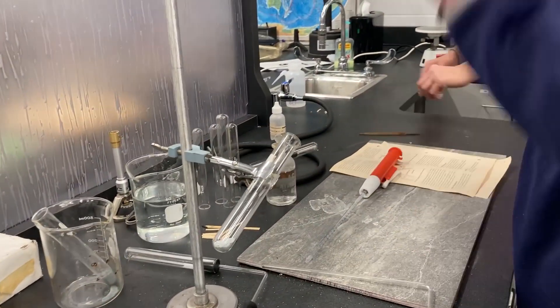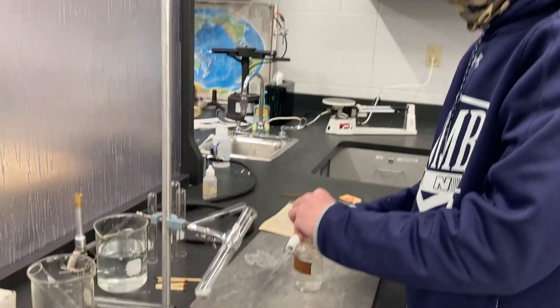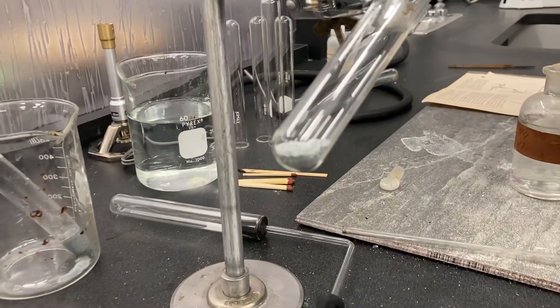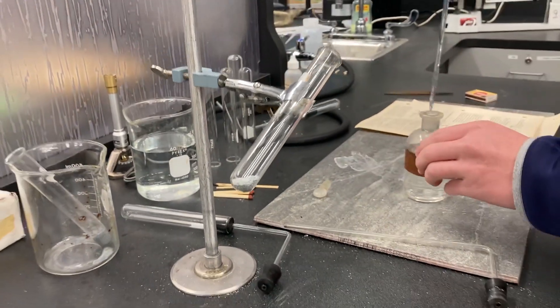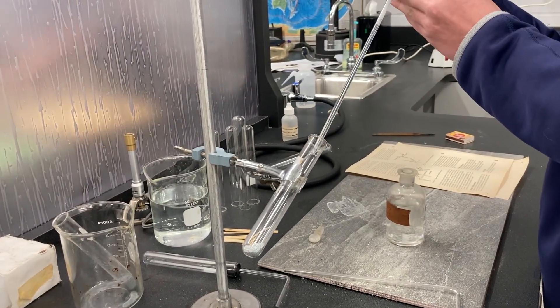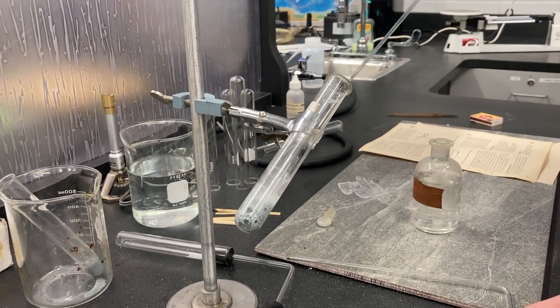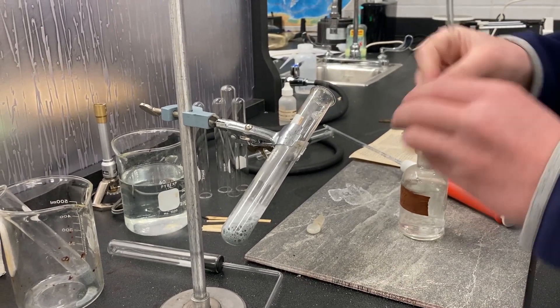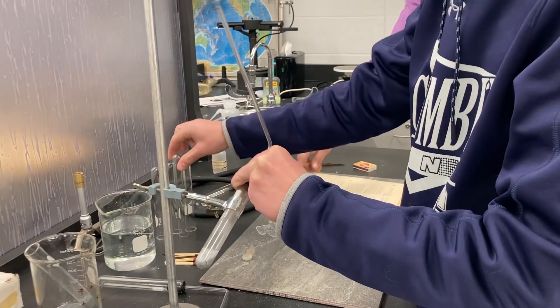The first step to this is to add the hydrochloric acid to the zinc. This creates a chemical reaction which will create this gas which we're going to capture with the stopper and put into test tubes.